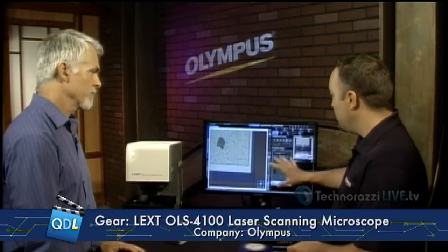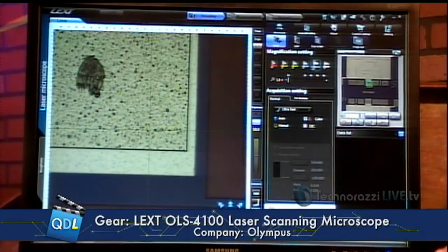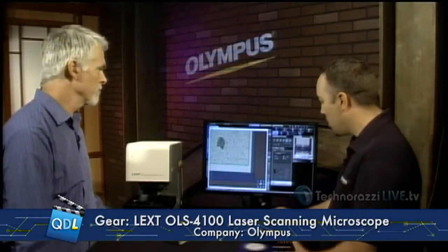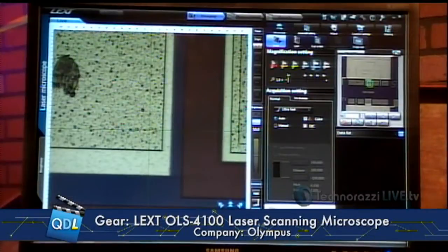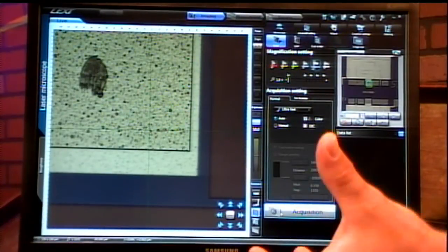It's capable of doing three-dimensional imaging, so we can measure steps, volumes, and all different kinds of things. The new user interface with the 4100 makes use as simple as possible, so most people who have ever run any kind of microscope can walk right up to the tool, quickly move around their sample with the live color imaging mode, and then it's just a simple button push for acquisition. With the new software on the 4100, we're capable of doing ultra-fast scans — a single button click generates a smart scan feature, which has the tool setting all the parameters for you: brightness, set points for heights, and your focus.